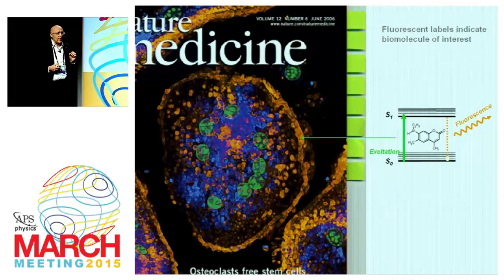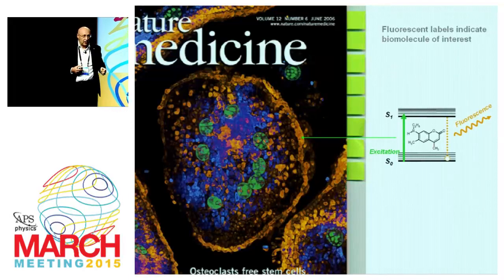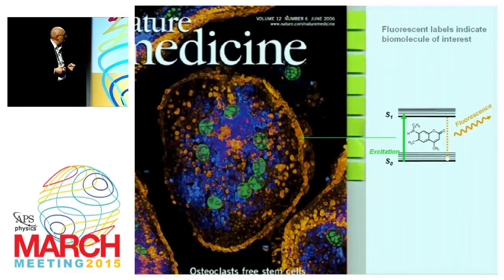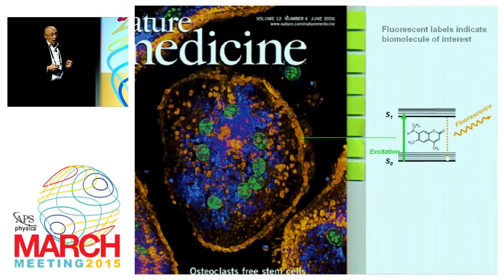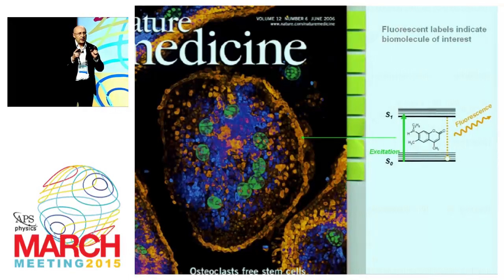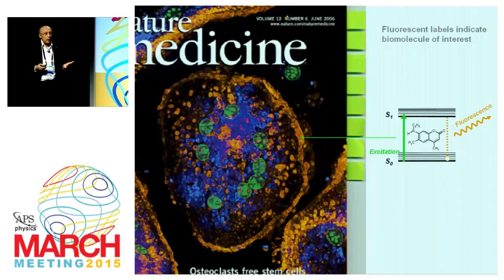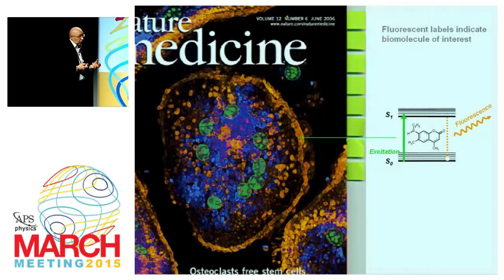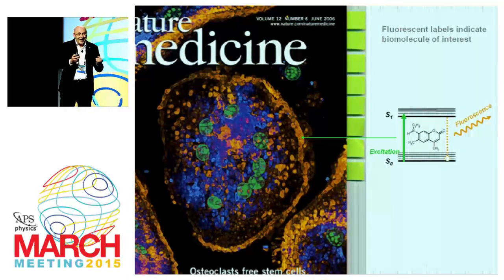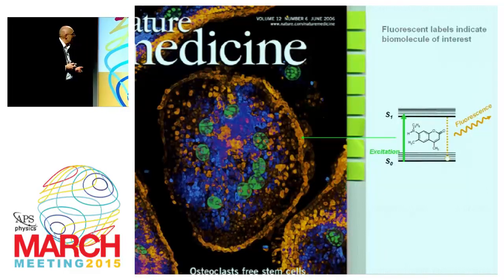In fact, it is so sensitive that you can detect even a single molecule, as has been discovered by my co-laureate W.E. Moerner. However, if there is a second molecule, a third, a fourth, or a fifth, coming closer together to the first molecule than about 200 nanometers, as we all know, we cannot tell them apart. So the resolution is of course about telling things apart, discerning details, seeing features as distinct entities.